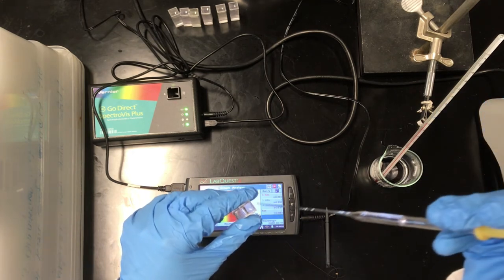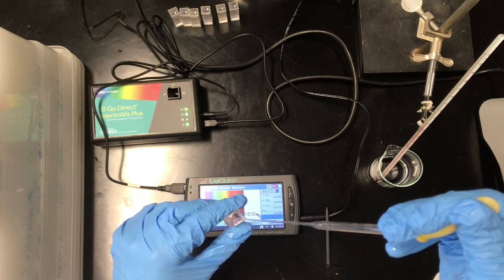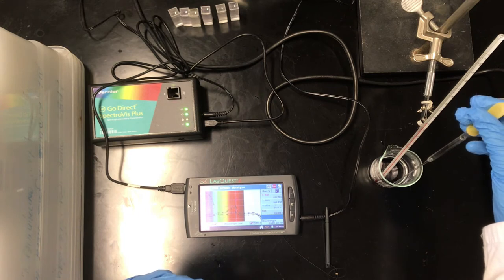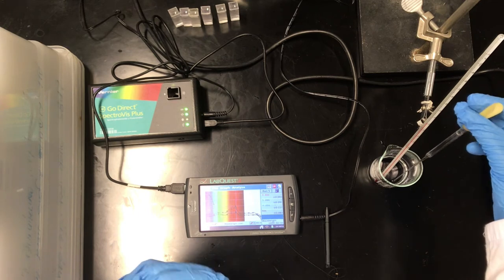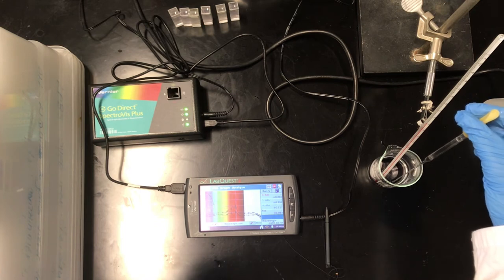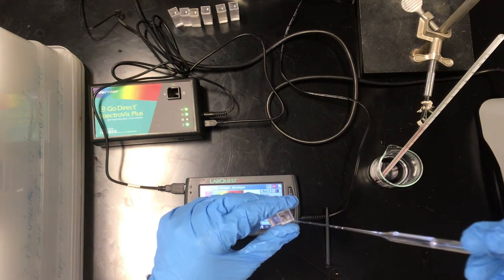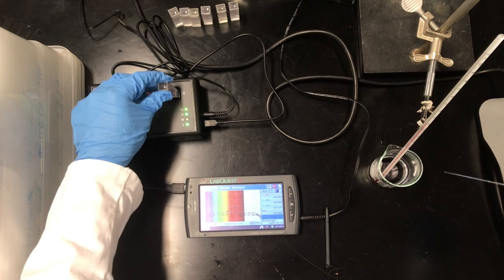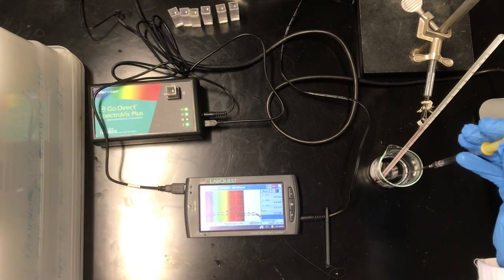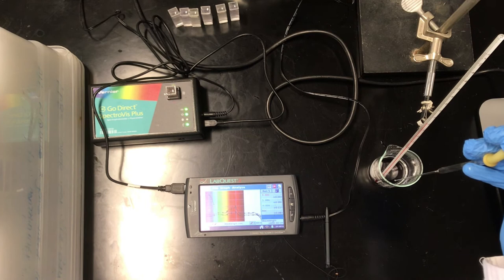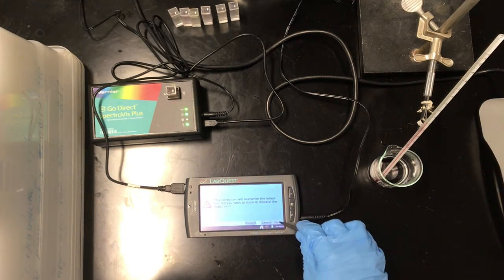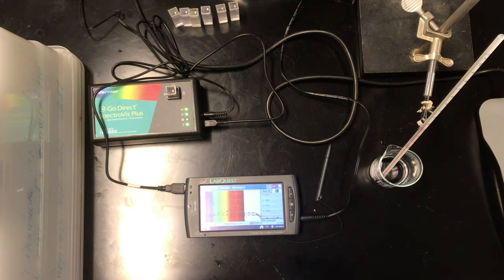One thing you're going to be asked to think about in the data workup for this experiment is, well, you'll be asked to calculate delta H and delta S under standard conditions for the reaction based on these results. This is actually all you need to do that, thanks to the definition of delta G and the relationship between the equilibrium constant and delta G. This data we're collecting is all you need to measure delta H and delta S, and then explain why delta H and delta S have the signs that they do based on the nature of the reaction itself.